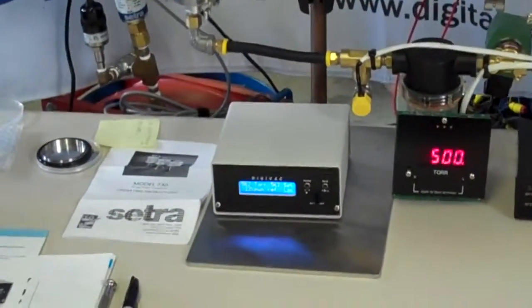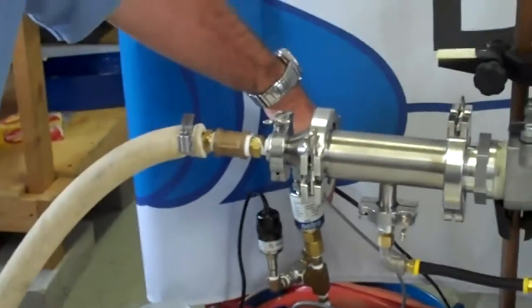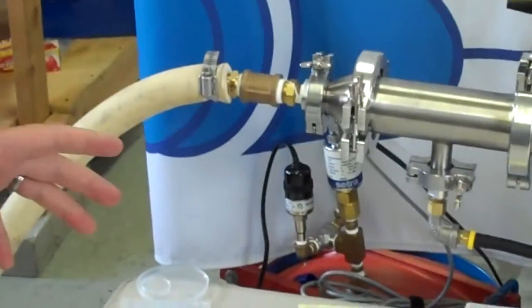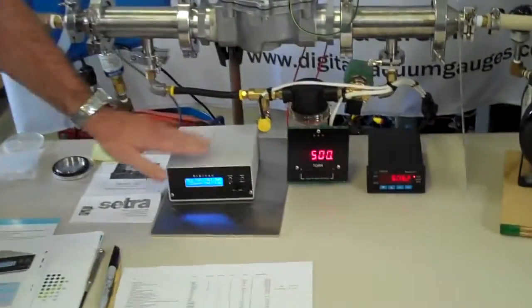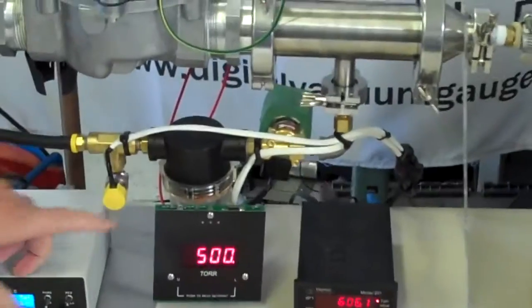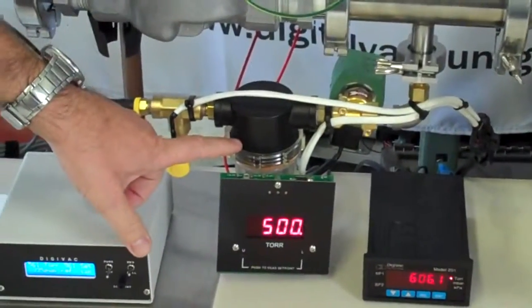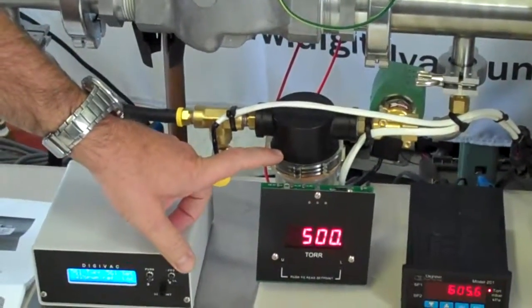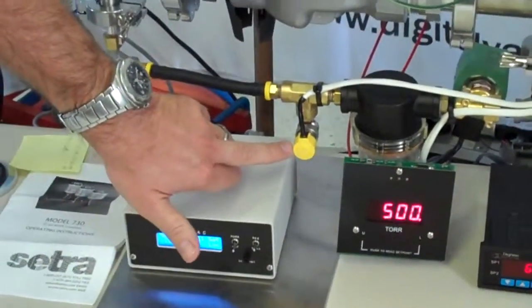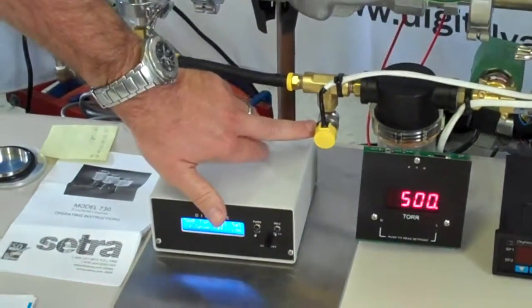What we have is our Model 450 that's taking its sensor readings from this 1000 torr capacitance manometer. This customer wanted all of the actual control mounted inside, mounted actually on their plumbing. We took the valve that's native to the controller and brought it out here. We have just a quick filtration here to make sure any of the contents of the process don't contaminate the pump. And then we also have the bleed valve here as well.